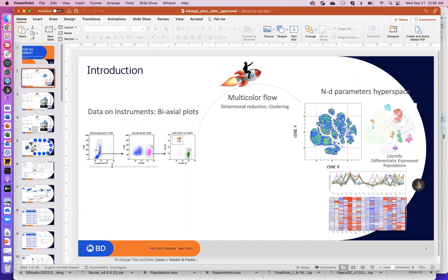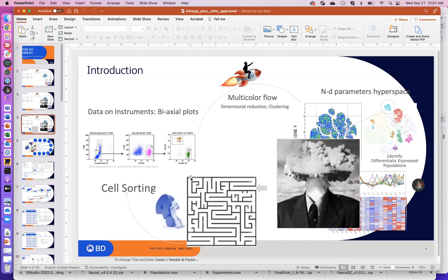We also do this in sequencing, in that we use antibodies that have been tagged with oligos, and you can put a lot more antibodies onto cells in that instance, because you don't have to deal with fluorescent spillover, et cetera. But even in those experiments, you have to use these tools because the complexity of the experiment is so great that you have to use something to simplify the information. All of these tools help to alleviate the burden of going through really complicated data. All the possible combinations can be mind-blowing.